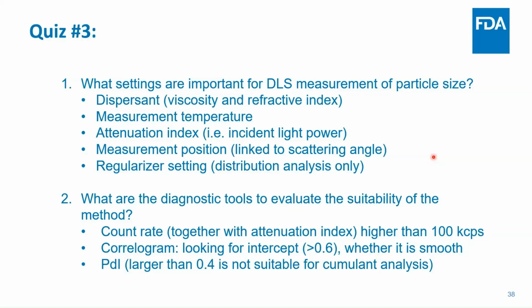That just means that you're not basically out of correlation with yourself from the initial get-go, which is a signal of it being too concentrated when it's well below that 0.6 value. Every once in a while, if you have something that's contaminated with micron size things, you can get a correlation function above 1. And so those are the things you want to look between 0.6 and 1.